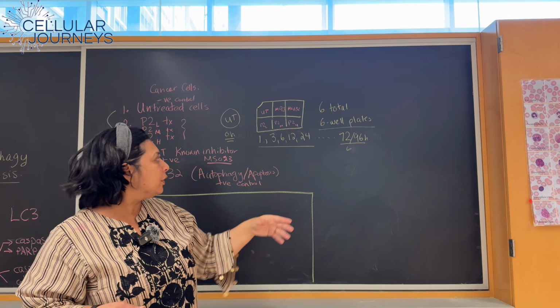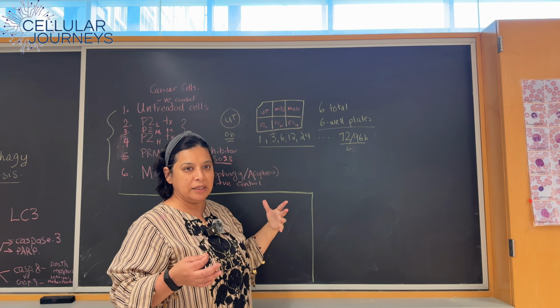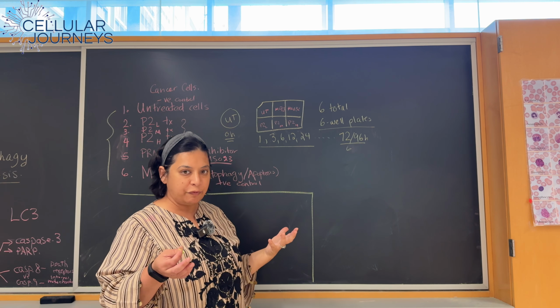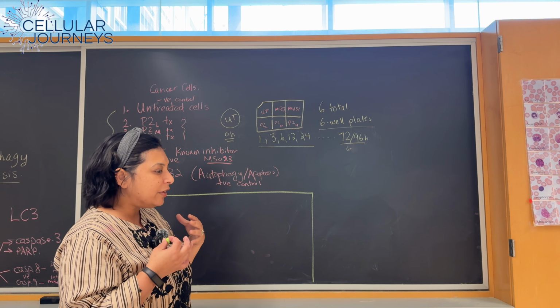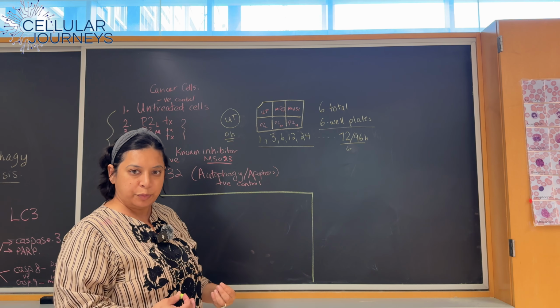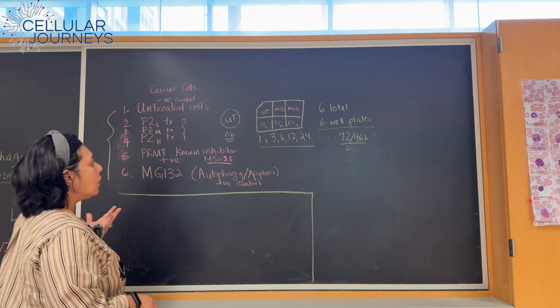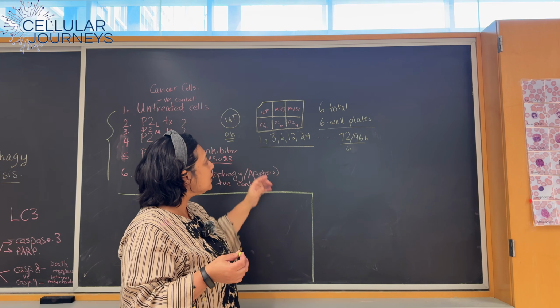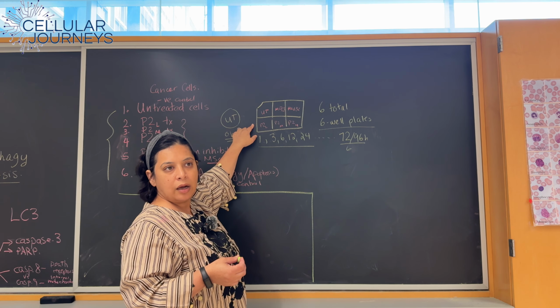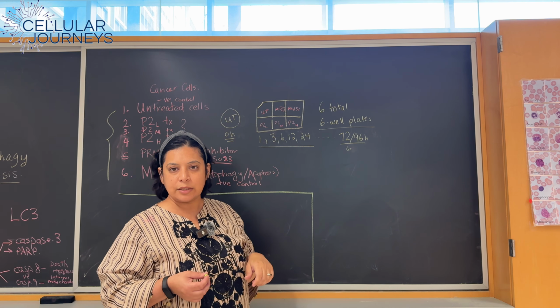But typically my goal, and I have some early time points, so that's not a time when cells are going to be dying or getting too much effect. You're just looking at molecular effect. So you want to have enough cells to be able to extract a lot of protein from them. You don't want to start off at 10%, right? So if I'm going to be plating them at about 50 to 60% confluence, then one plate of cells can give me 2 plates of 6 well plates.